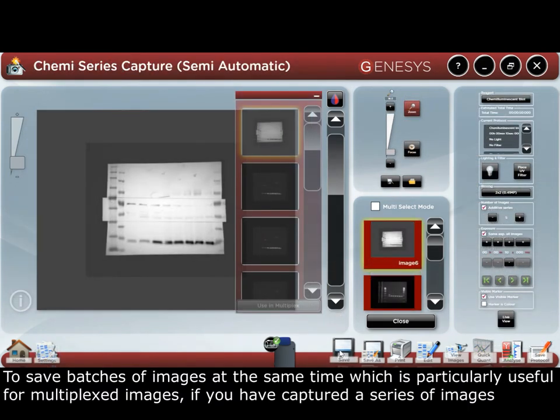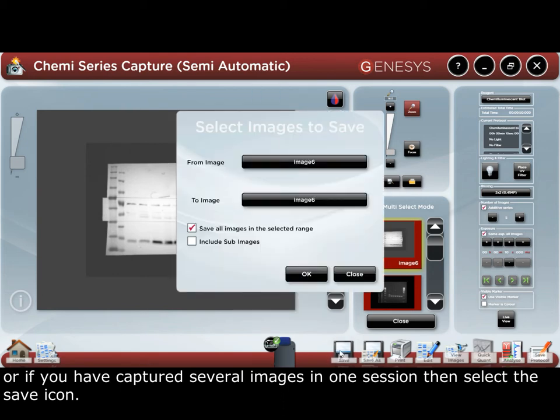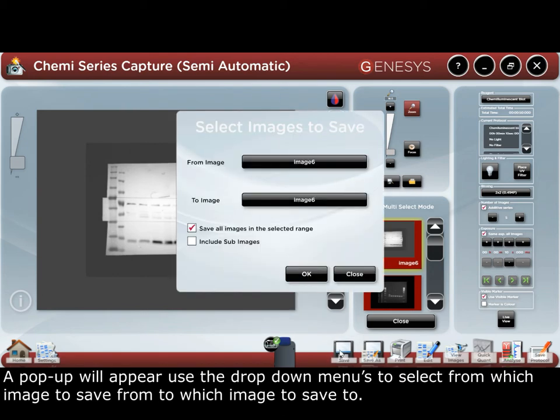To save batches of images at the same time — which is particularly useful for multiplex images, if you've captured a series of images, or if you've captured several images in one session — select the save icon. A pop-up will appear; use the drop-down menus to select from which image to save from, to which image to save to.